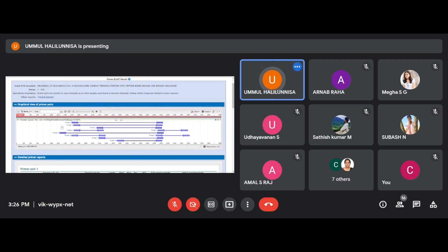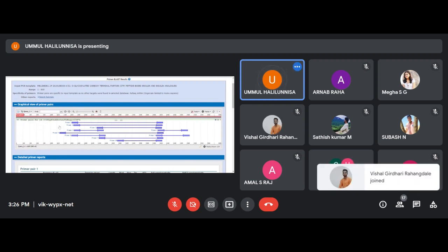We have to reduce as much as we can and include the protein coding sequence, so I should start from here, from ATG. I have to check manually. In that case, I have to manually design this primer. I have to see the sequence first.